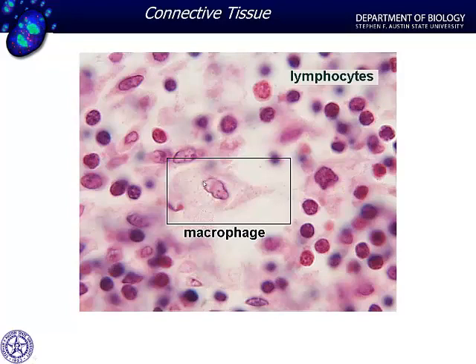Here we see a fairly large oval-shaped nucleus. We see nice round nuclei with these other cell types. And a little bit of an indentation. Usually you're going to see a little bit more of an indentation with these macrophages. In the plane of section, it may not be visible at all, but this is a nice longitudinal section through that oval nucleus of a macrophage.